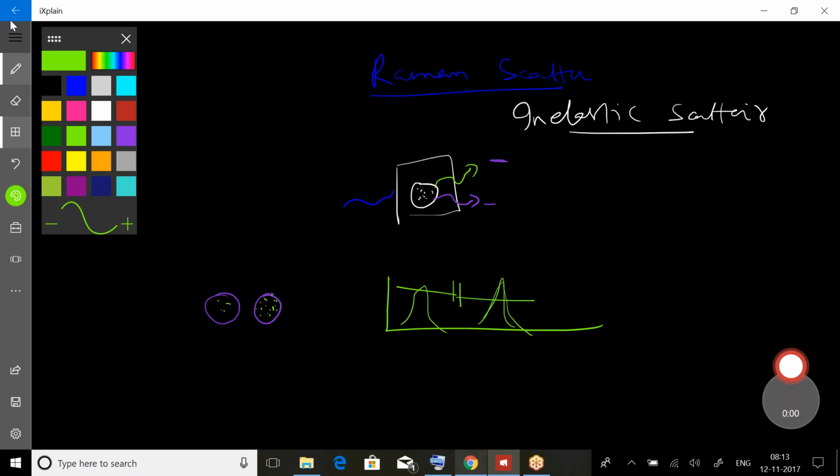However, on flow cytometry, even if we have a cell which is not at all expressing any of these proteins, we still get a signal.